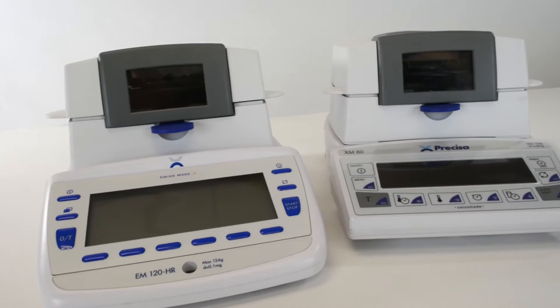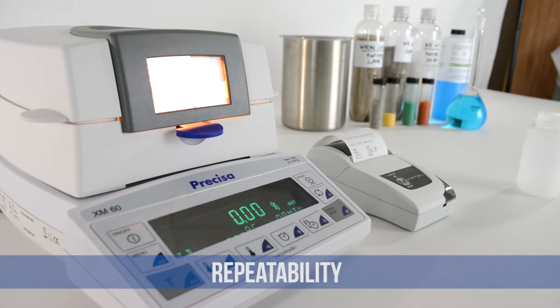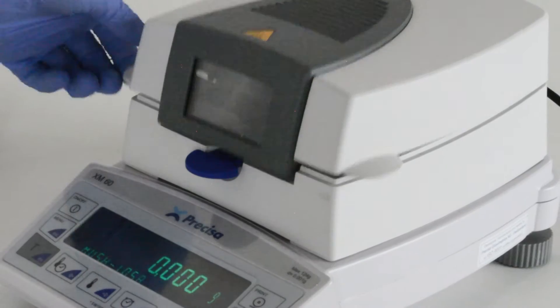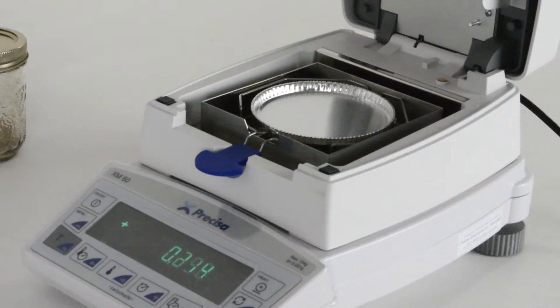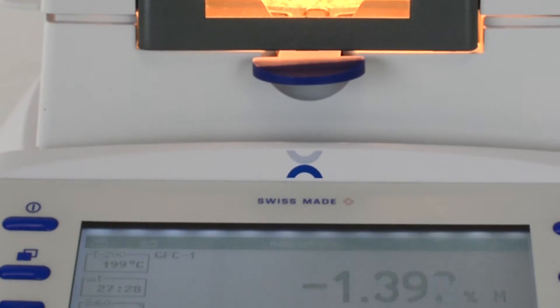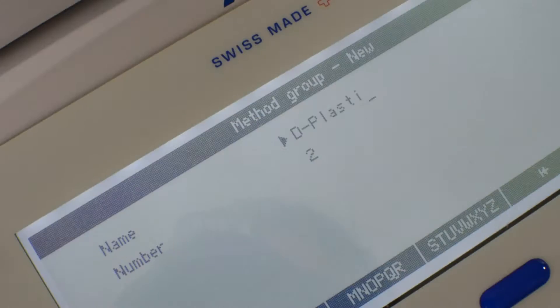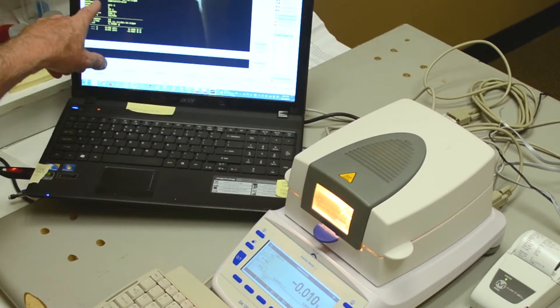For reliable results in moisture analysis, you need accuracy, repeatability, and good balance software for record keeping. Accuracy is established by good calibration. Repeatability is established by good balance design and manufacturing practices. And with flexible connectivity options and output settings, you can count on the balance software for great record keeping.